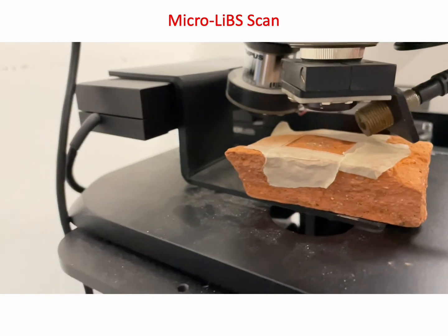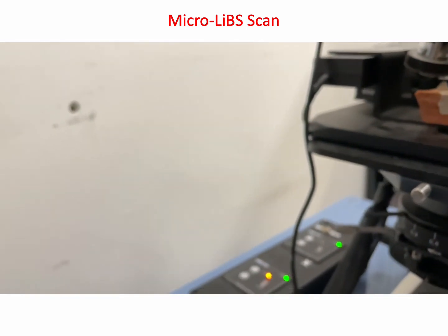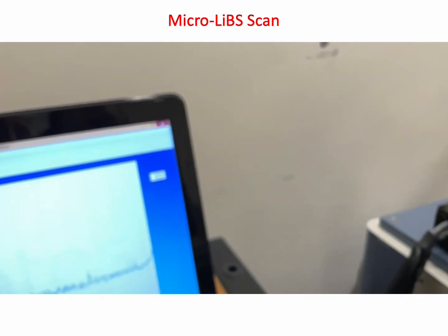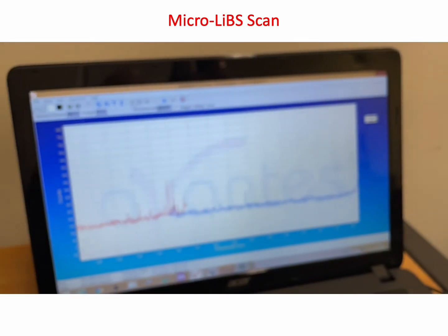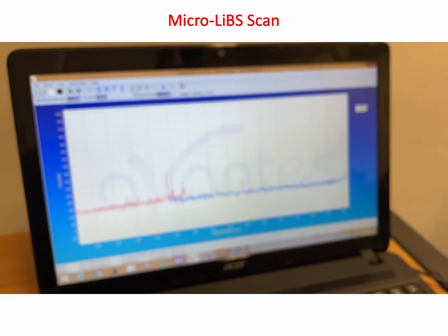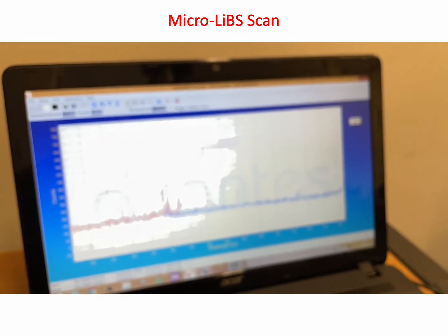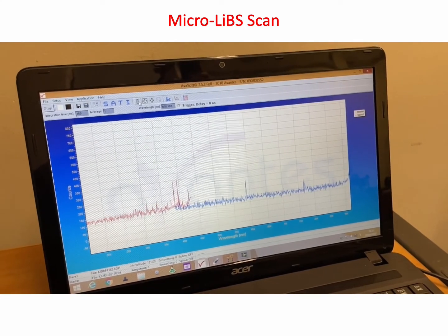An in-house developed software controls the step motors that are synchronized with the flash lamp of the laser system and the spectrometer trigger. Up and down, left to right, the laser beam scans the sample surface, acquiring step by step different spectra.